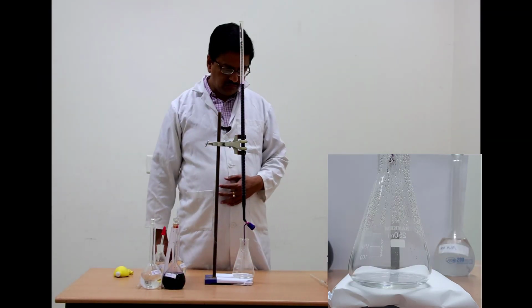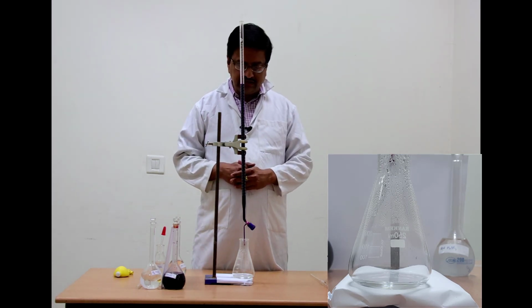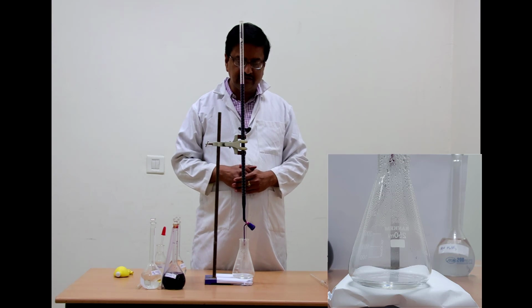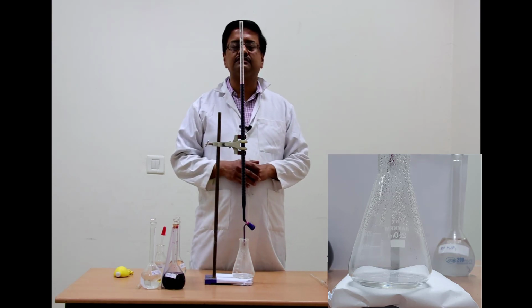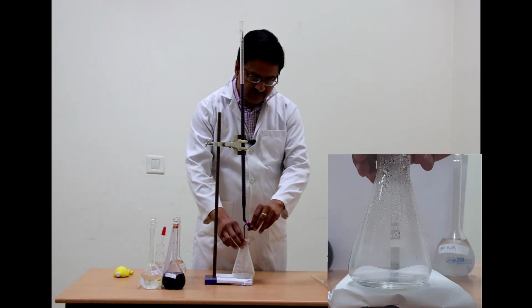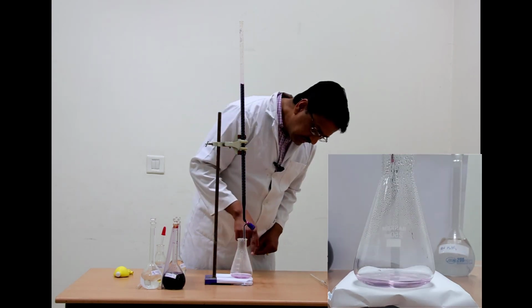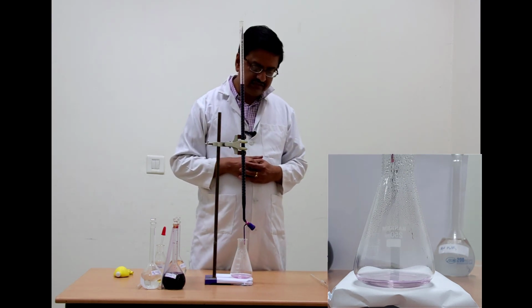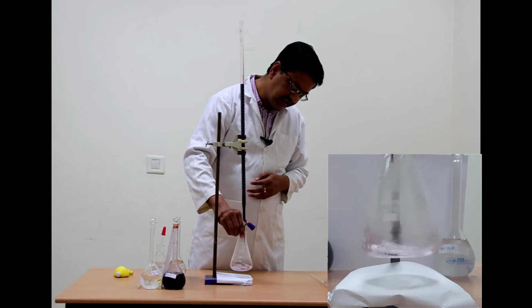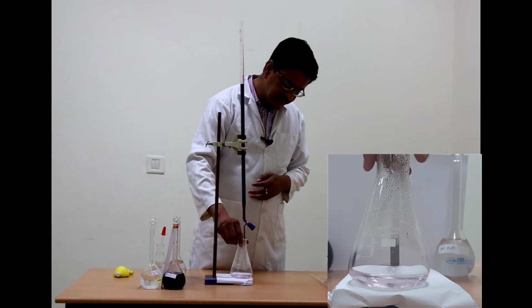So now we are again ready to do a second titration of permanganate with oxalic acid. We have already taken 10 ml of oxalic acid and 10 ml of 4 normal sulfuric acid, heated it to about 70 degrees centigrade, and we are going to start this titration from the point where we ended in the last titration, that is at 12 ml. So once again, just to demonstrate, you see after addition of the first drop, the faint pink color does not decolorize and it stays for a while. Even when the solution is hot, this faint pink color continues to stay for about 30 seconds and then it decolorizes.